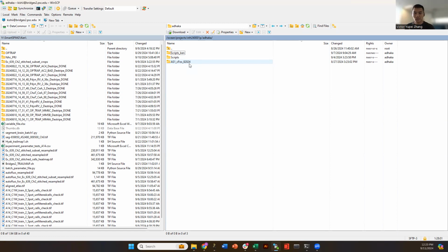So I think there's multiple approaches. What you're trying to say is that should you make a classifier specific to a batch? My thought process is that ideally you shouldn't, but there are cases that you have to. In an ideal scenario, you want to wait till you collect all of your data. If everything looks similar, make a classifier using all of the images.